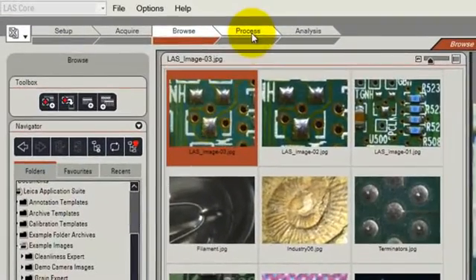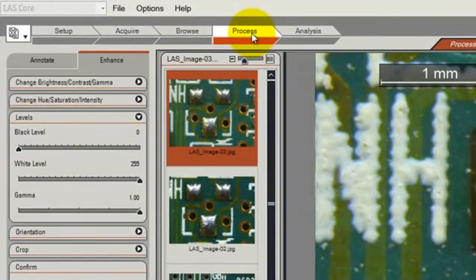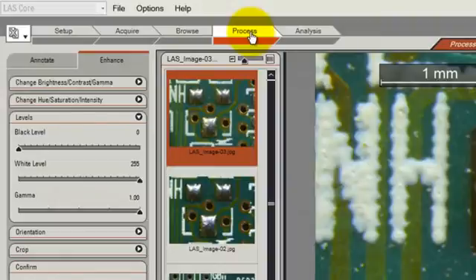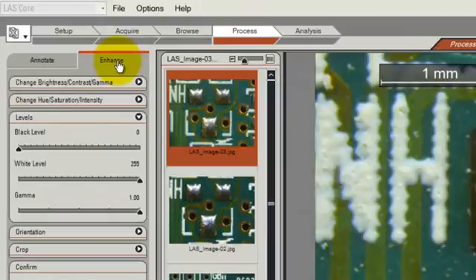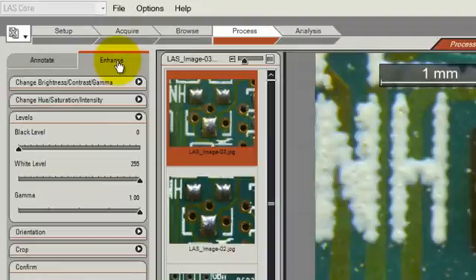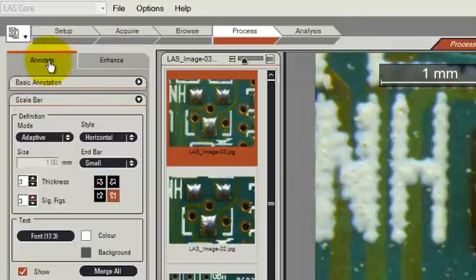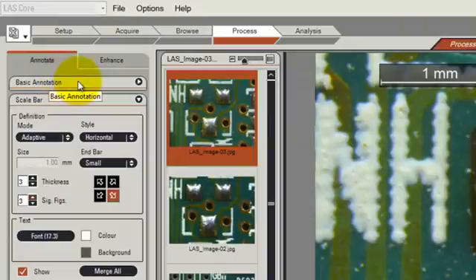The next step is the Process step, which comprises two main functions. One is called Enhance, which allows you to make adjustments to the contrast and color of the image post-capture. The second area is called Annotate, where we can get direct access to various annotation functions, which we'll discuss in another video.